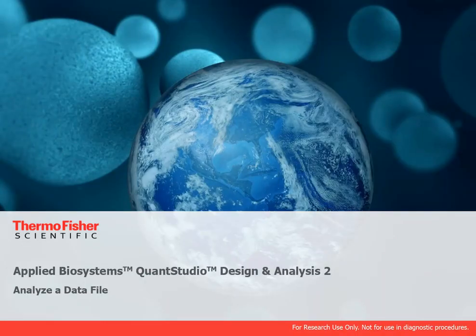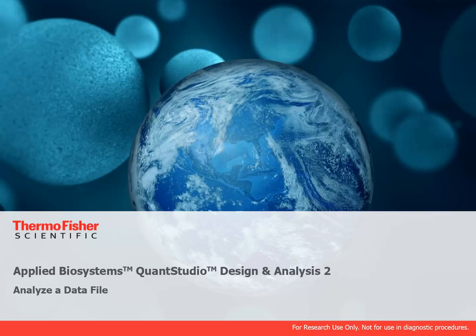Welcome to the video tutorial series for QuantStudio Design and Analysis 2. For this tutorial we will be using the desktop version of the software, but you can also use the application on the Connect platform. In this video, we'll show you how to analyze a data file.